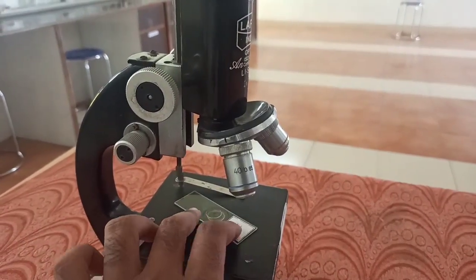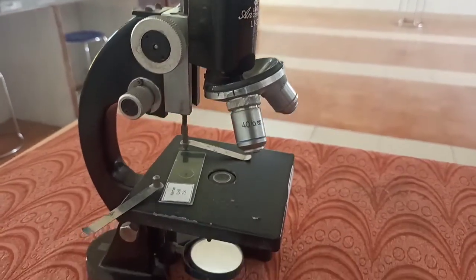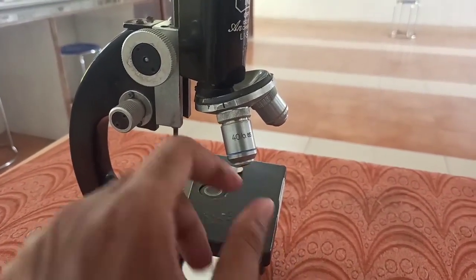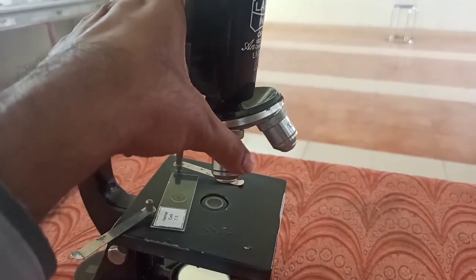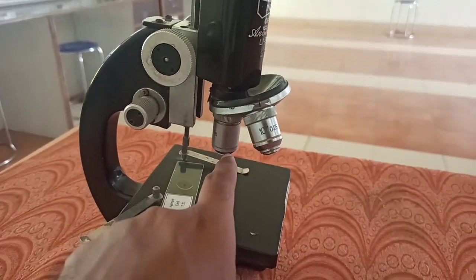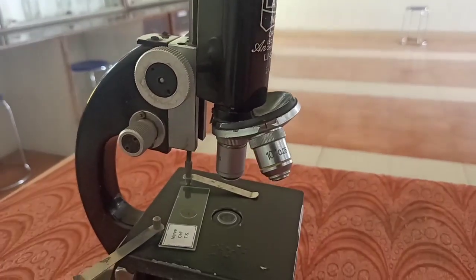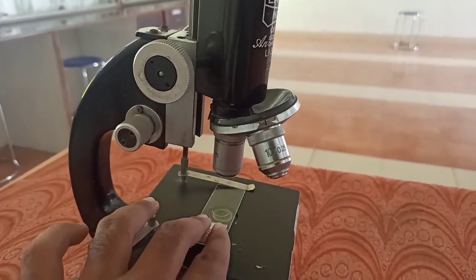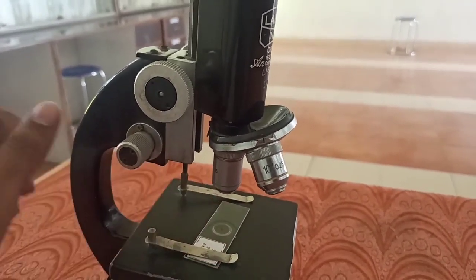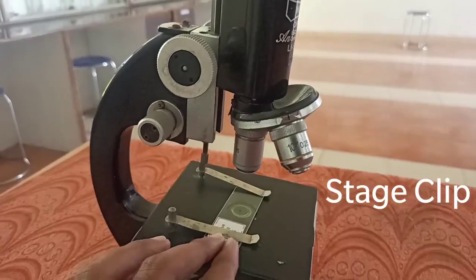The slide will be placed like this. There is a hole for passing the light. Light will pass through this hole from the reflector, as you can see here. Through this reflector, light will pass through here and through the objective lens, it will be set in position. The light is going to pass through the lens and will be visible. So this slide needs to be kept here and it will be fixed by placing the clip over it.